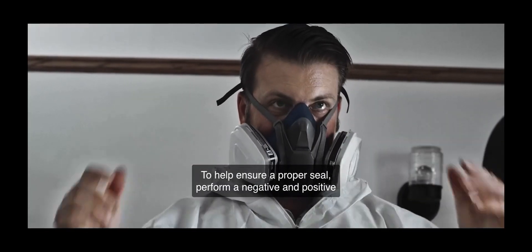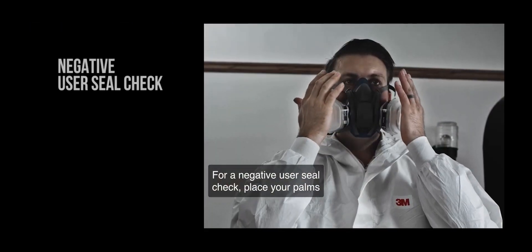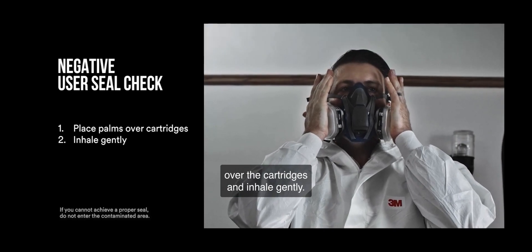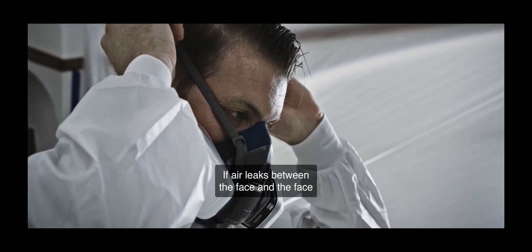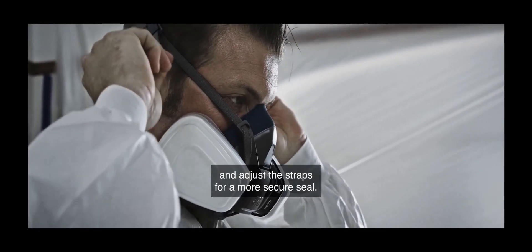To help ensure a proper seal, perform a negative and positive user seal check. For a negative user seal check, place your palms over the cartridges and inhale gently. If air leaks between the face and the face seal of the respirator, reposition it and adjust the straps for a more secure seal.